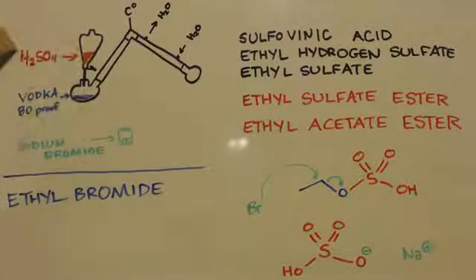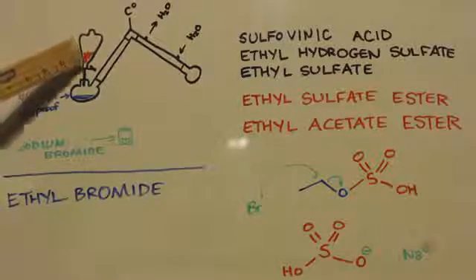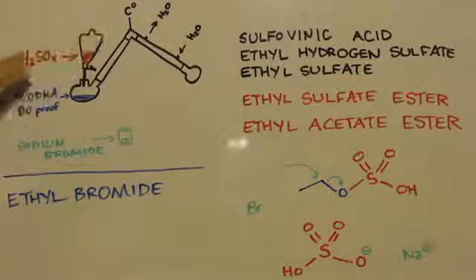Basically, I'm going to get some drain cleaner, sulfuric acid you see here, put it in the separatory funnel so I can drip it in. Actually, it's an equalizing funnel.